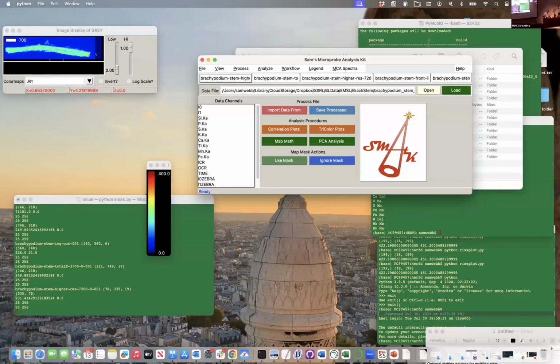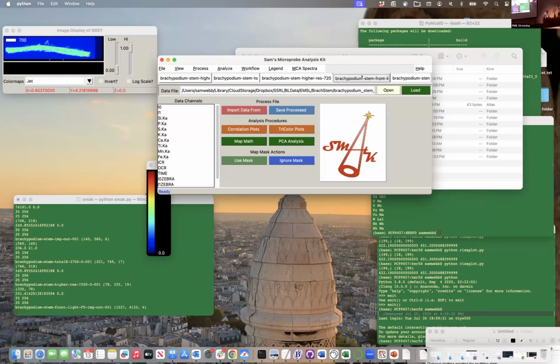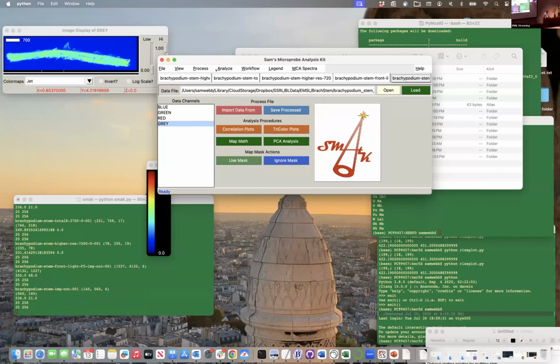So I could zoom around and adjust, but I can also use this method of coercing these data sets together. We're going to find that coercing the data is a popular theme, because, remember from the talk yesterday, when you try to put the data sets together and they all look like you're going through a time warp, when the merging doesn't work, we have to do the manual steps. How do I do the manual steps? We're going to do that with this data set here.